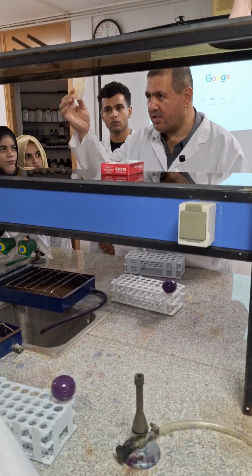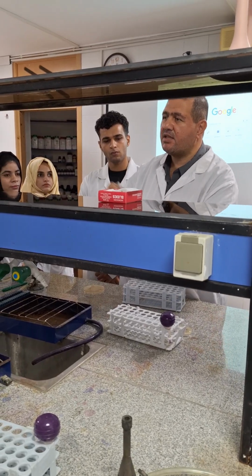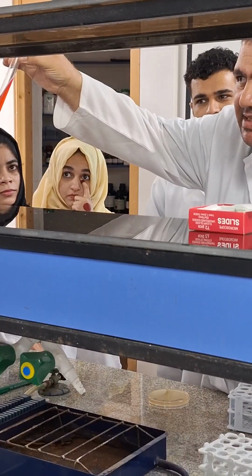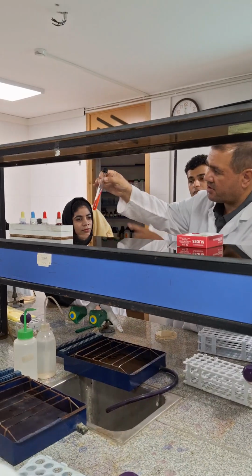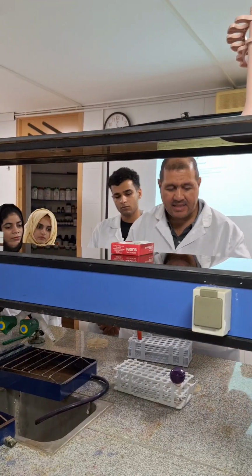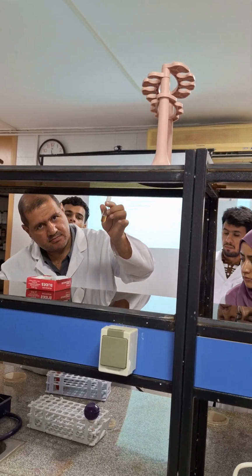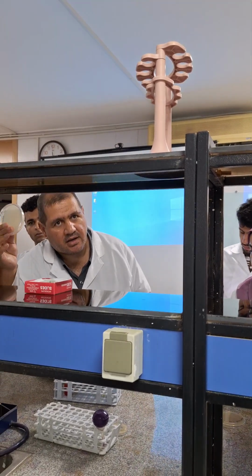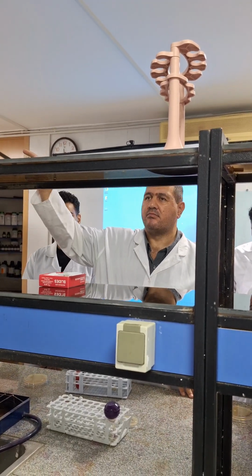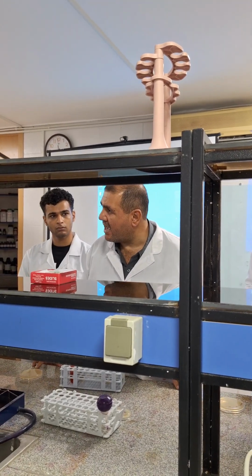Solid media come in a plate, or in a tube in the form of a slant medium. A slant in Farsi is sheetdar. Pay attention: a slant area and a bottom area of the medium. And liquid media are without agar. Solid media contain agar. And semi-solid media such as SIM, sulfide, indole, and motility, is the name of the medium.